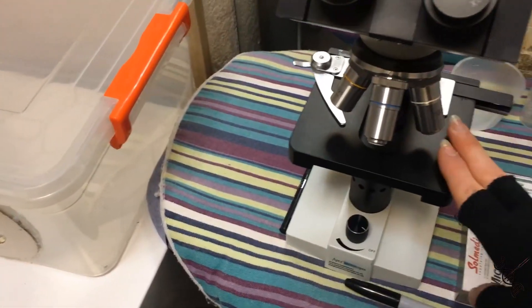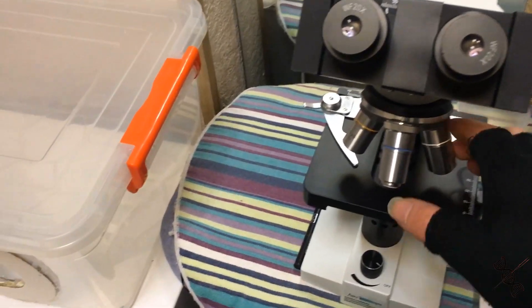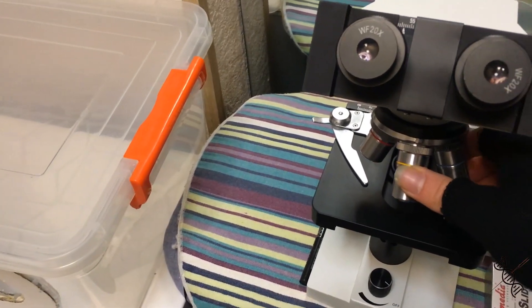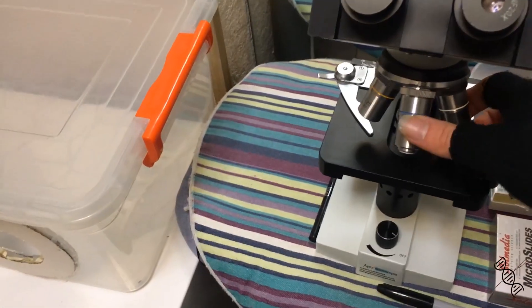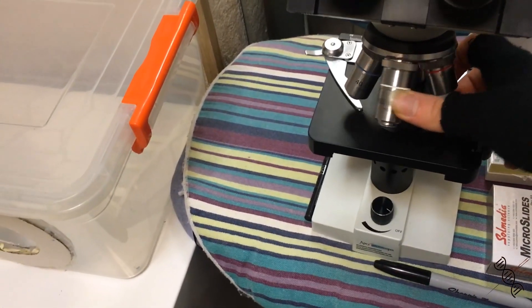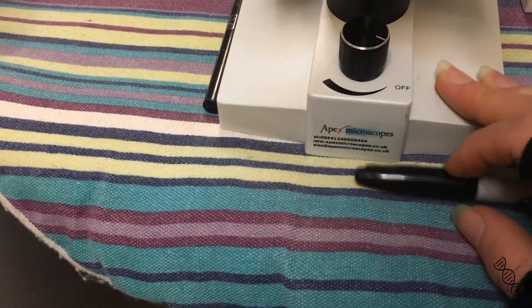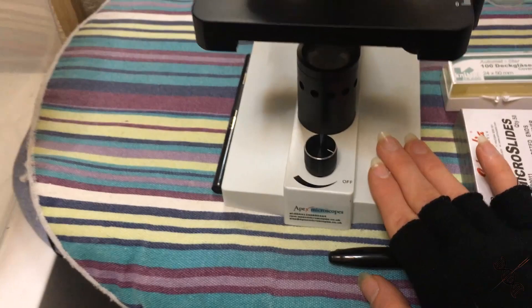Next, let's move on — this is my microscope. It's pretty handy, like it's a normal low-cost microscope with immersion lenses. It's the Apex brand, and it works pretty well.